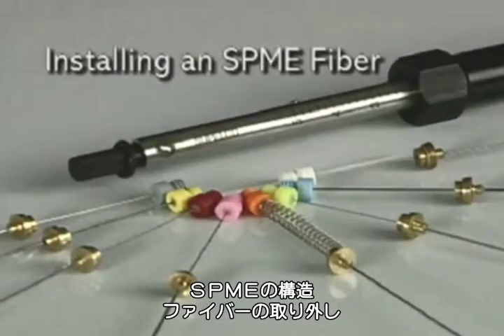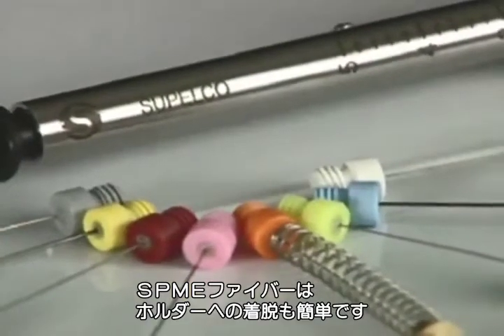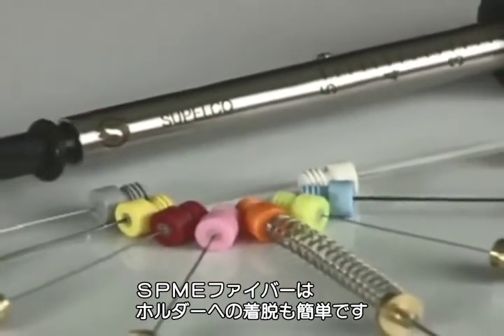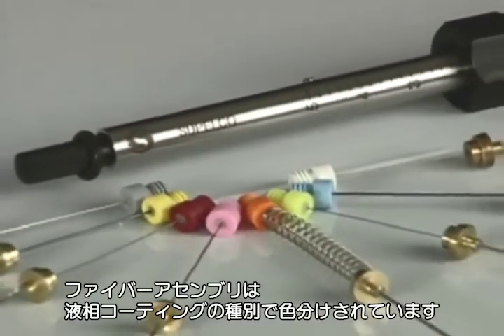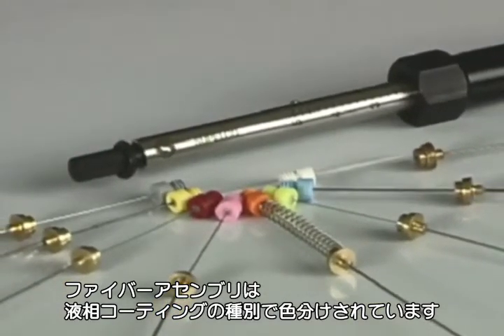Installing an SPME Fiber. SPME fibers are easily installed or replaced in the SPME holder. The fiber assemblies are color-coded to signify the polymer coating on the fiber and contain threads to screw into the holder barrel.